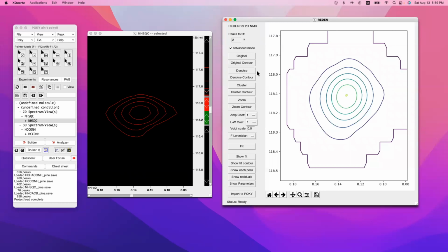And like basic mode, you can set the number of peaks you think are there. Otherwise, you can just follow the default value. This default value is one more than the local maxima it can find. So I'm going to stick to the default value here. And so there are 4 different intermediate processing steps here.